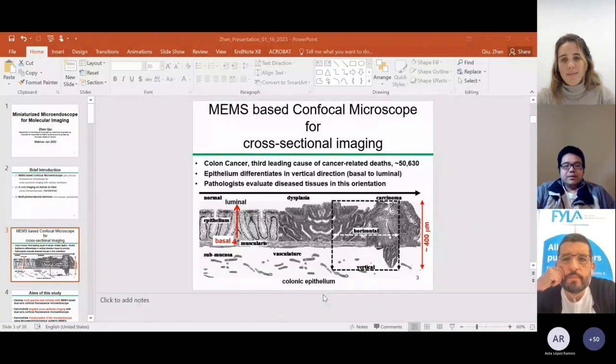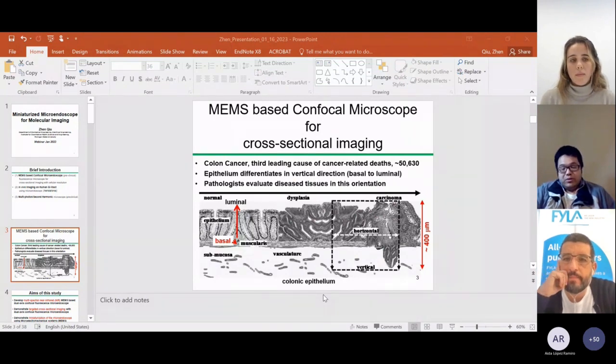But actually, in the future, we are working on fluorescence lifetime, if it's possible. We are testing it using the portable system to do fluorescent lifetime right now, based on the same architecture. It's not published yet, so we haven't shown the result. But we did get a result one month ago, before Christmas, using FYLA's supercontinuum laser. The imaging looks very promising.